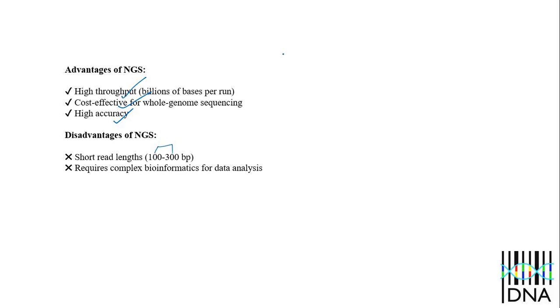For interpreting the data of NGS, you require complex bioinformatics tools. In a normal Windows environment, we can't analyze this data. To analyze it, we require a Linux environment.